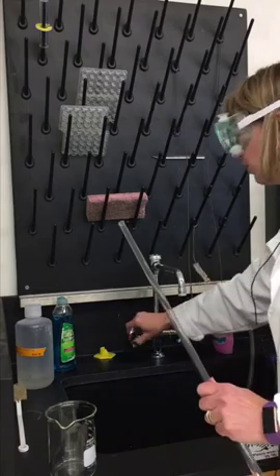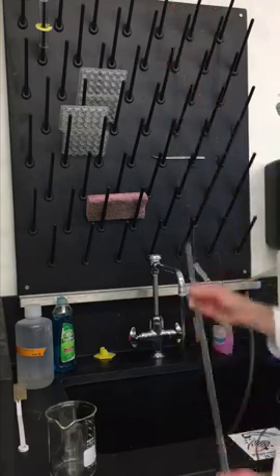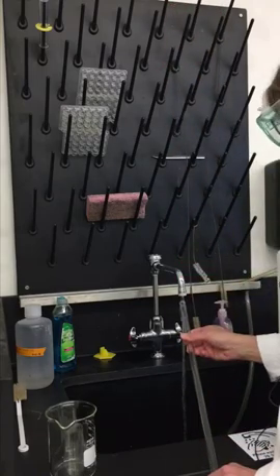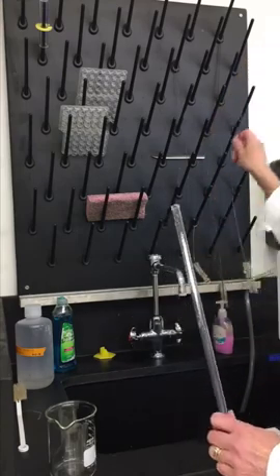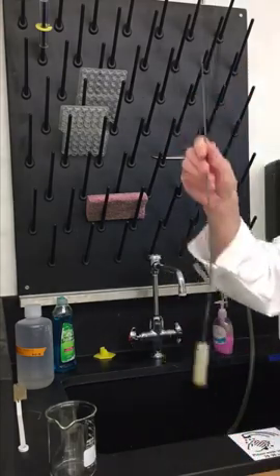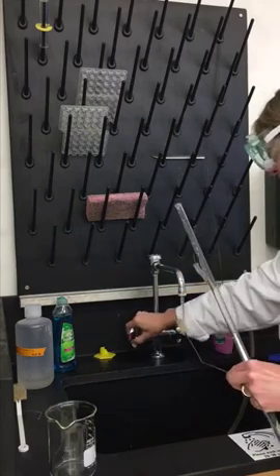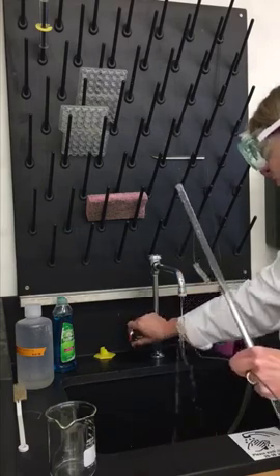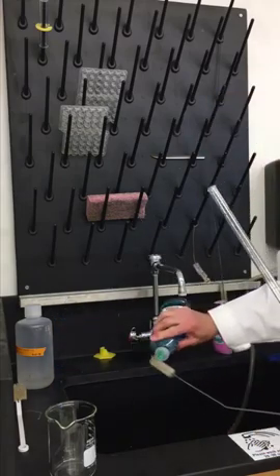What we need to do is make sure your stopcock is closed, then add some water to our burette. We're also going to use one of these — this is a burette brush. It's very long. I'm going to get the brush wet and add a drop of liquid soap onto the brush.